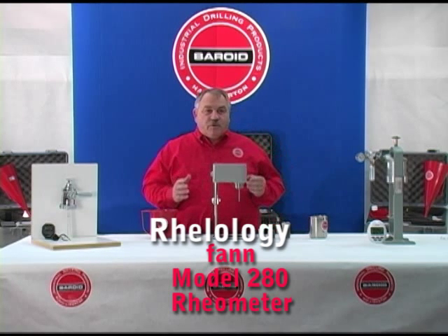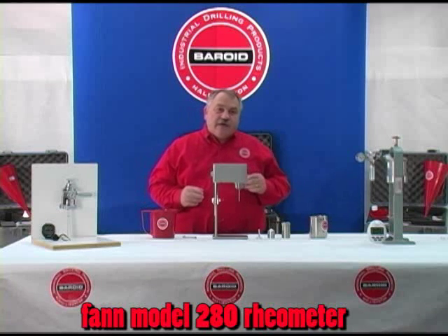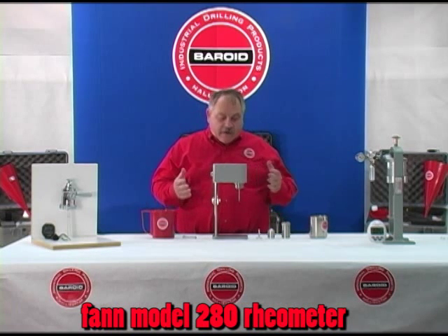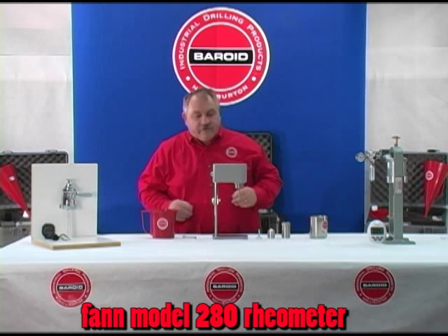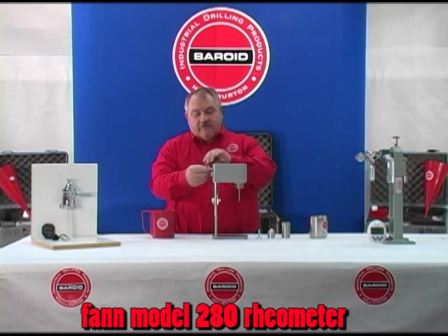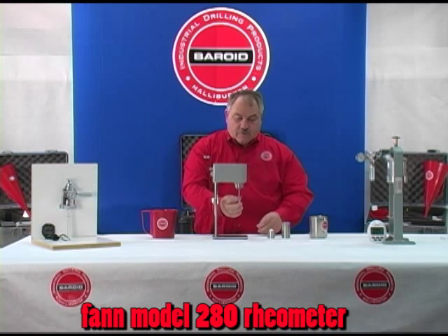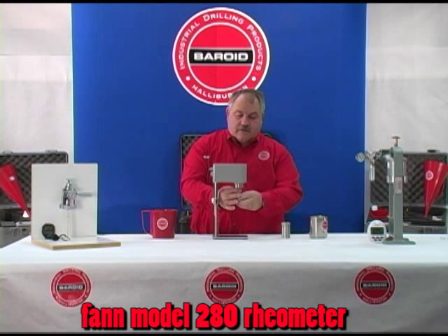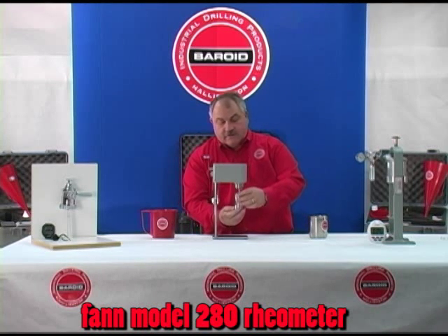A more advanced piece of equipment for field testing of drilling fluids is the Fan Model 280 rheometer. This is a hand crank model. It comes in pieces to be put together out of the test kit for the first time. We have the body of the unit and the hand crank that we need to add first. We have to put the bob on, and then the sleeve.